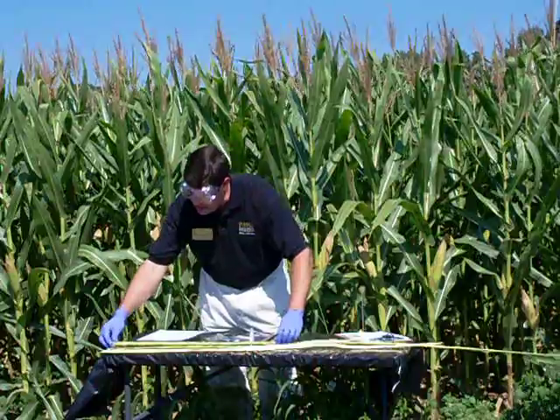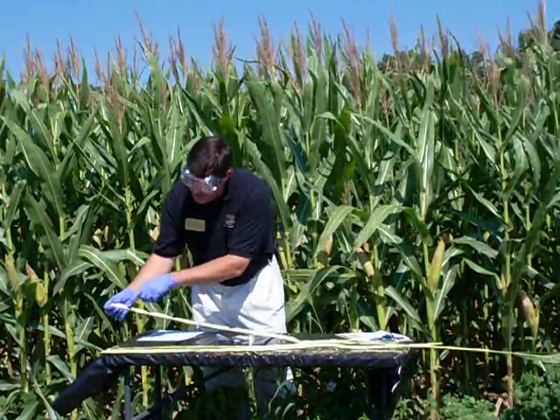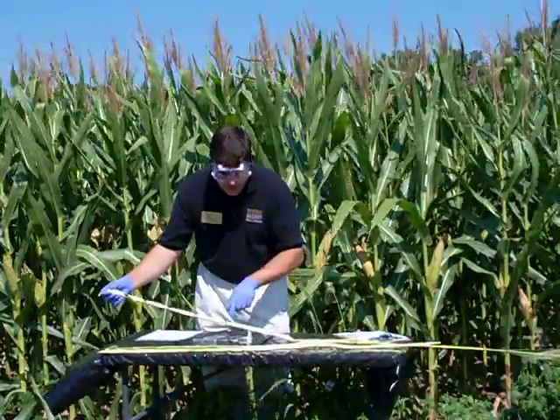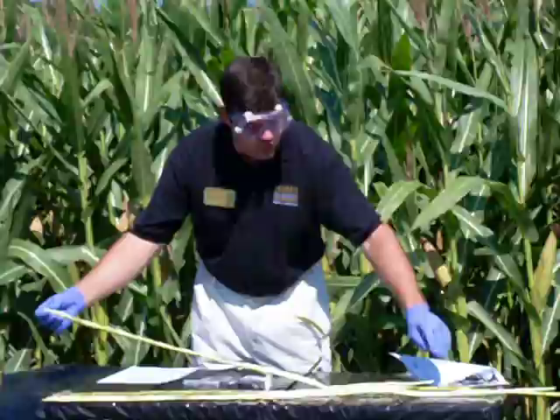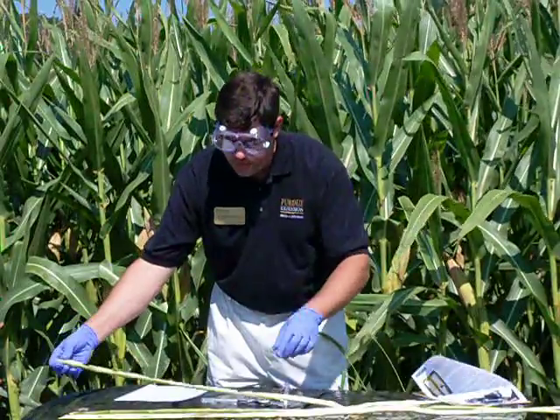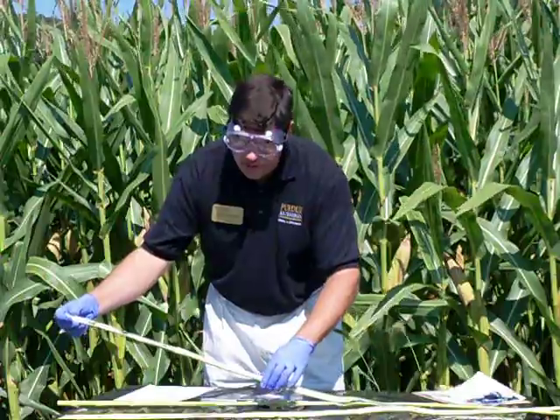The crop we have right here, we can see there's very dark areas indicating there is nitrate in this crop behind me, and it's going up as far as I've tested it. In a normal circumstance, I'd go ahead and test the crop all the way up to the top just to find out exactly where we might have concerns, how much of this crop might be usable. The same also occurs in this second stalk, also taken from this field.